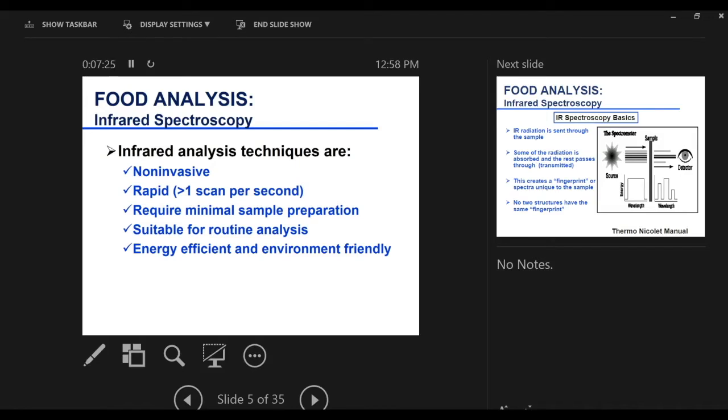Well, the ash content is correlated with the level of bran that you have in the sample. Was it refined to the level that we wanted it to be refined or not? And then you put your flour sample in the cell, and you do the measurement right away. Not much preparation.